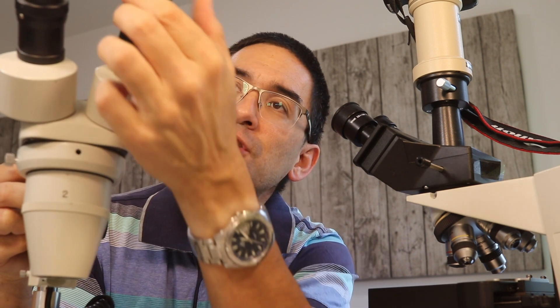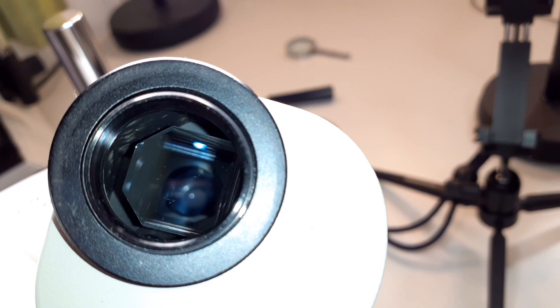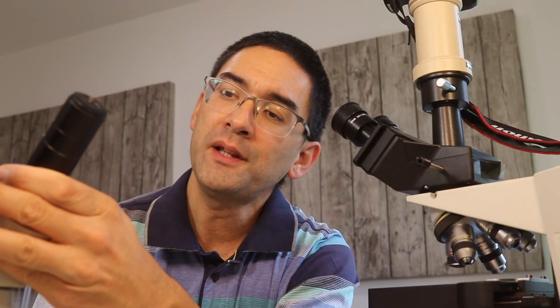In other words, they turn it 180 degrees so that you get an upright image at the top here. And the reason why this is done is because you want to make sure that the specimen, as you see it, actually also that you're going to manipulate it, you dissect maybe, it should have the same orientation as the way that you see it.